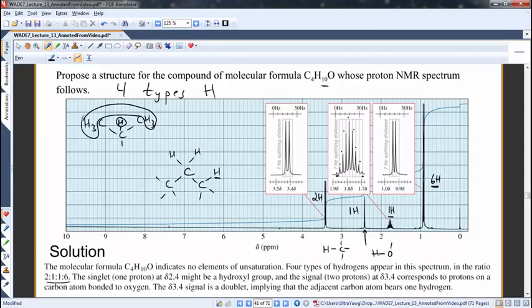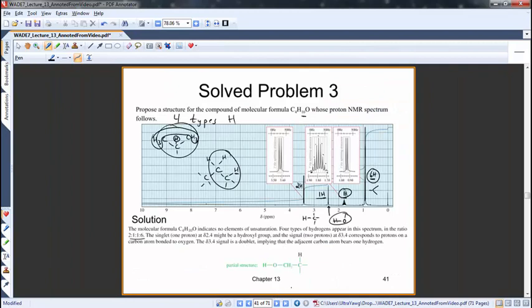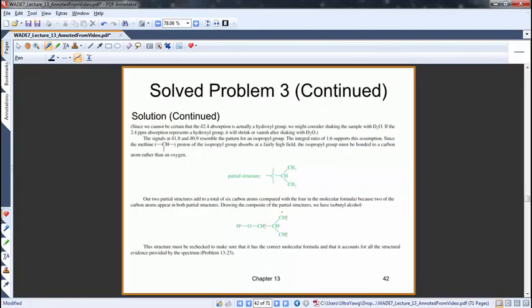We're going to ignore this for a minute and ignore that tiny little guy for reasons that are beyond the scope of this class. And so this guy then is the 1H. These guys go together and say, I have an isopropyl group. Then I have either an OH or a CH, and then I have a CH2. So if I draw these pieces floating around in space, there's really only one way I could put it together. We can only put it together this way. There's our isopropyl, there's our CH2 that has exactly one neighbor, and there's the OH, the 1H singlet.